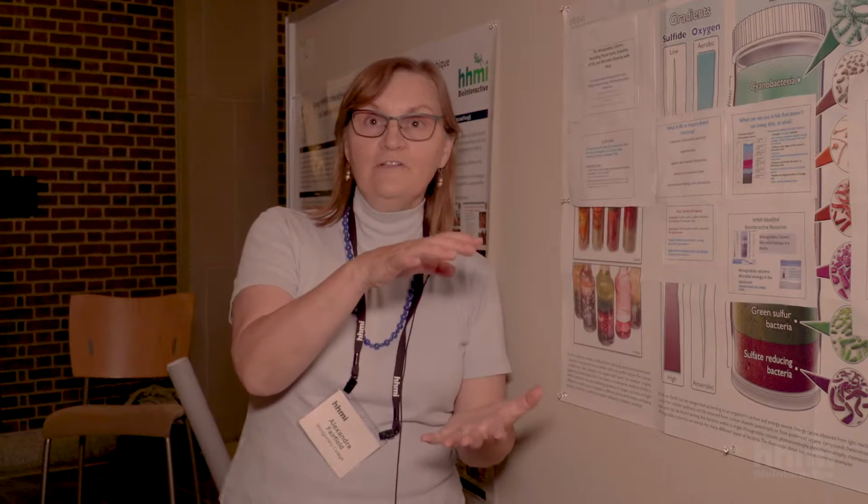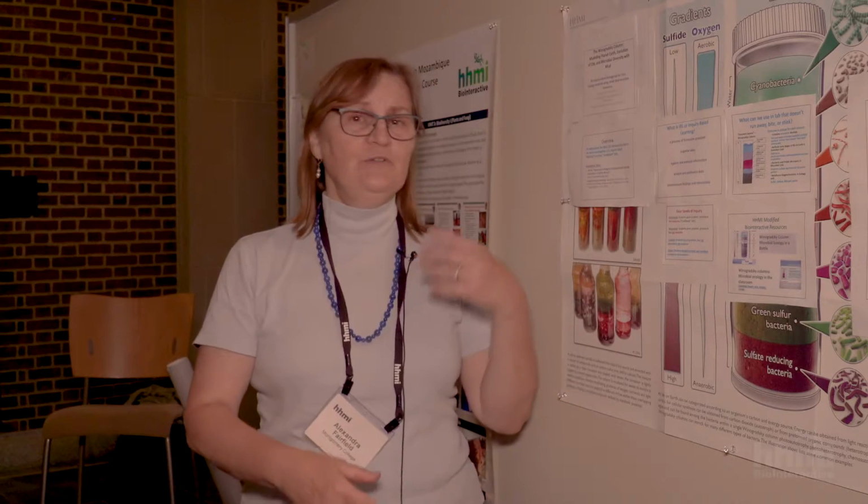second semester biology, and it's kind of an icebreaker lab. And I introduced it as a way of recreating the world using mud. So the students are given some guidance in terms of how they set up a Winogradsky Column, but they have to figure out how to do it. I showed them the equipment, and they have to choose what mud, what nutrients, what water they're going to use.